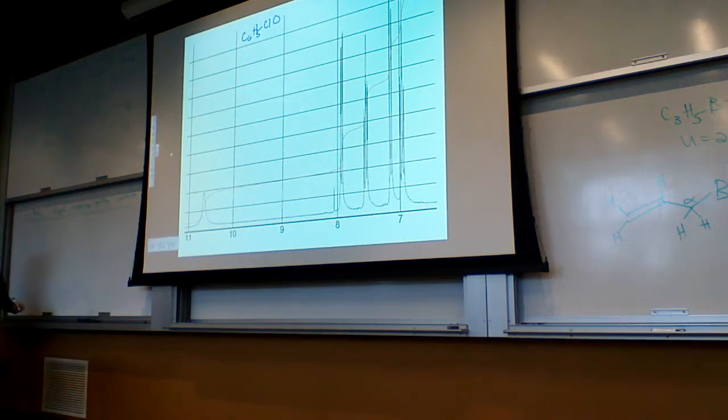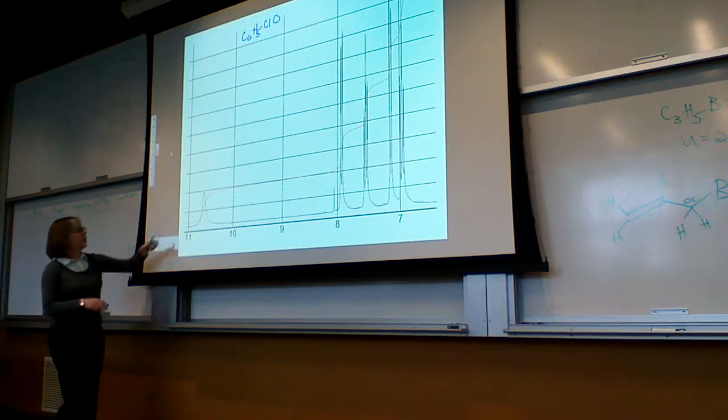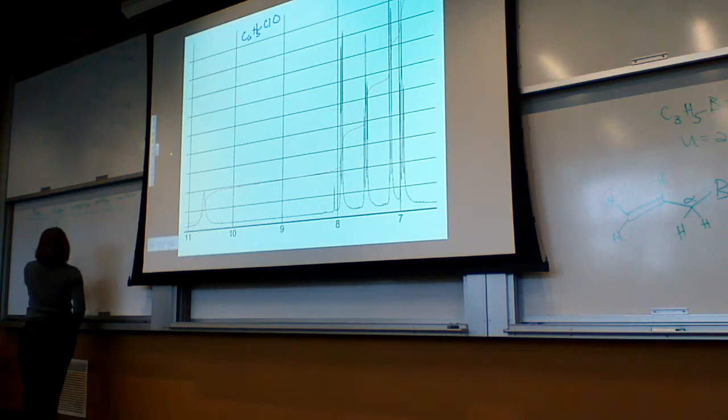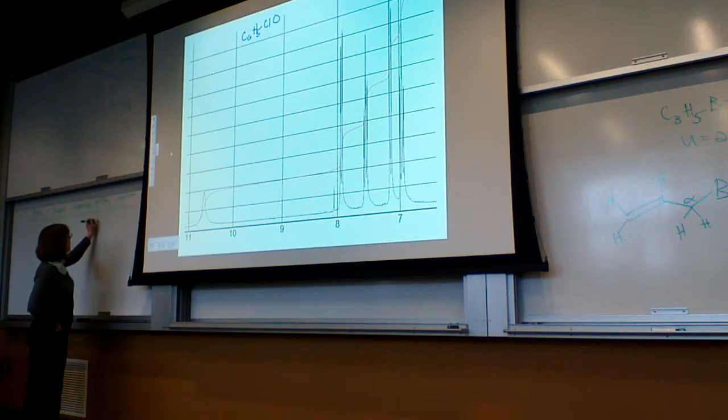So we have 4 peaks in here. 1, 2, 3, 4, 5, and 4 peaks. No, 5 peaks. Yeah, that's why I wrote 5. I'm just going a little crazy. 10.6 ppm for the first chemical shift, and we compare the integration here. It's about 1, 1, 1. They're all the same integration, so they're all going to be 1 in this one. And the splitting, this is going to be a broad singlet.